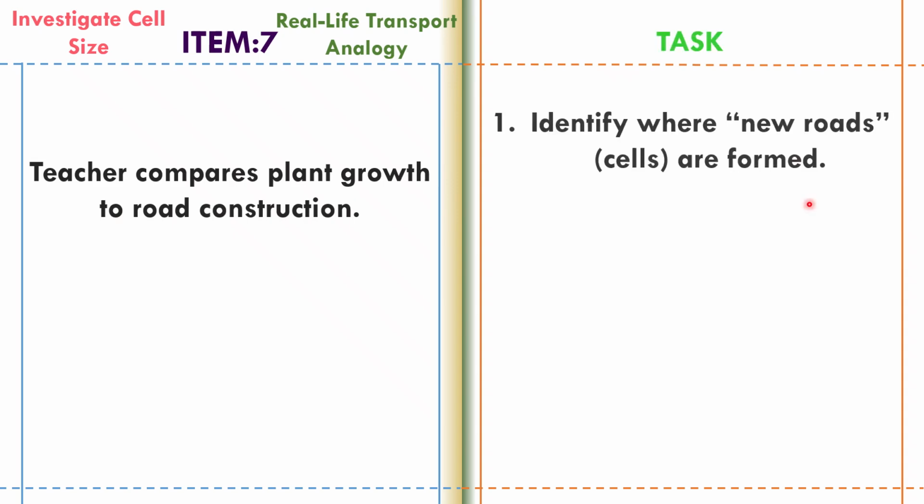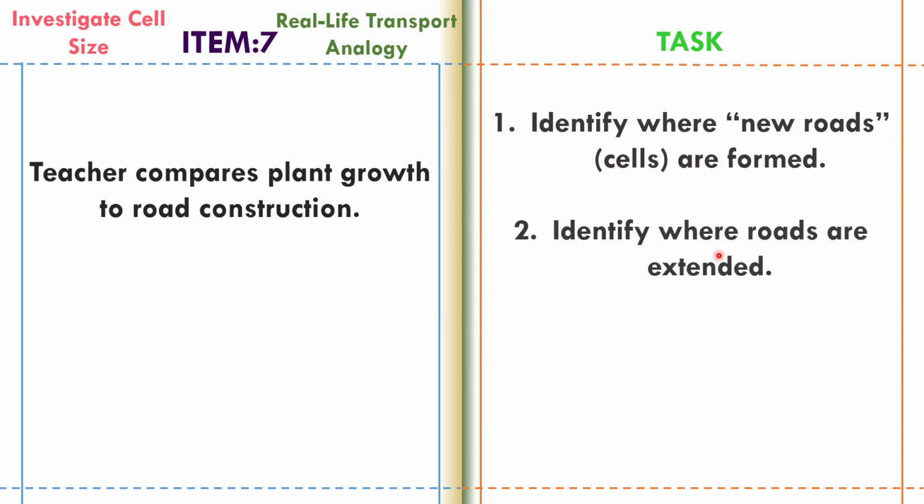Tasks: identify where new roads or cells are formed; identify where roads are extended; match regions to functions.